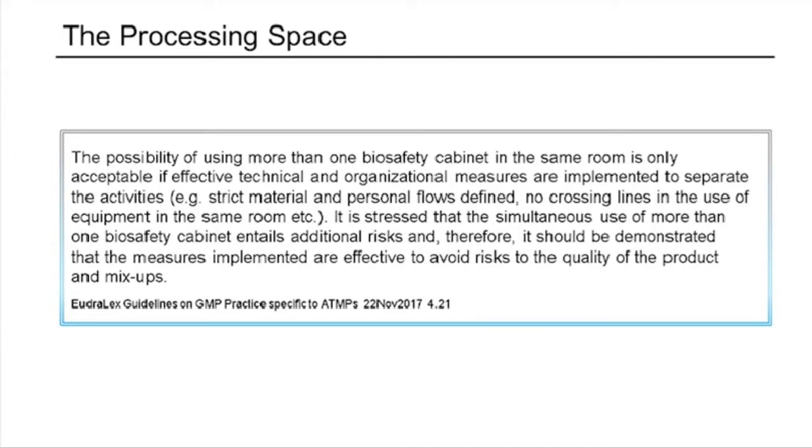And what they're talking about in terms of mix-ups here is really these operations tend to be more manual when you're using open equipment, a lot more operator-driven. And so they're really stressing that operations need to minimize as much as possible human error. Things like operators accidentally walking to the wrong workstation or accidentally bringing the wrong materials or leaving the wrong materials at the wrong workstation, because these patient-specific doses are so critical that any sort of mix-up like that could potentially have devastating effects on the patient.